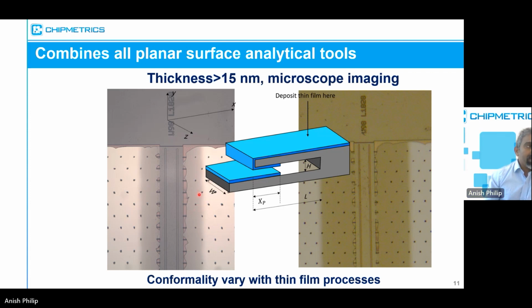Another thing is that these two measurements were done in two different labs, using two different optical microscopes, which is why under different settings you see a different color. It has nothing to do with your measurements; it doesn't influence the penetration depth. So whatever optical microscope you use, you can easily see the penetration depth of your process, though you see different colors. The color also depends very much on the material you used.